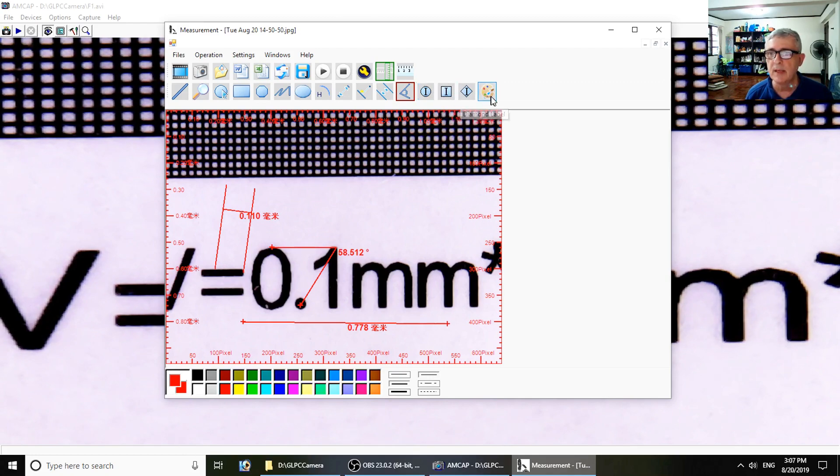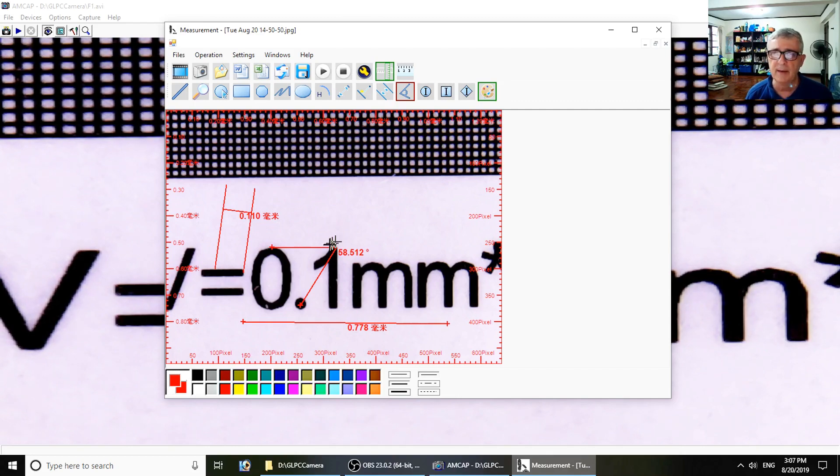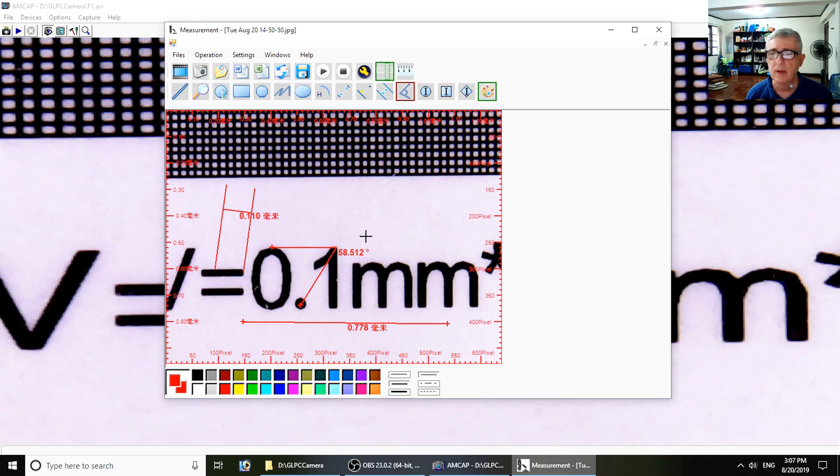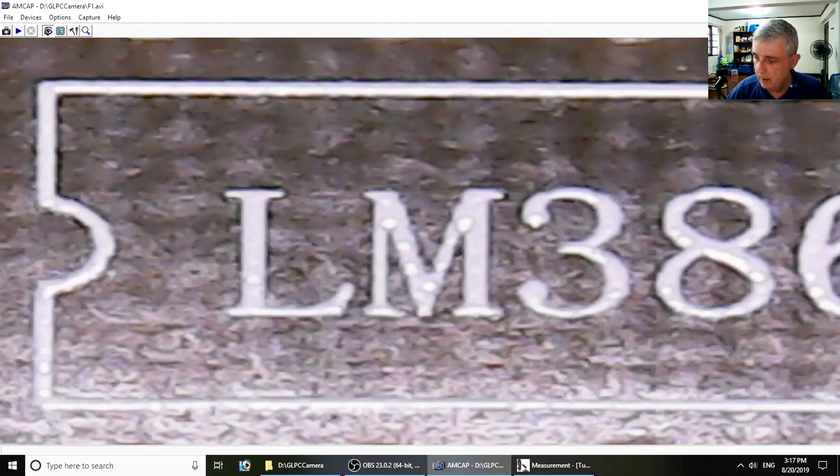These are just labeling the shapes and then the color settings. That's it - pretty simplistic, a lot like Microsoft Paint, but it has a couple interesting functions that make it worthwhile. That's it for their measurement software.